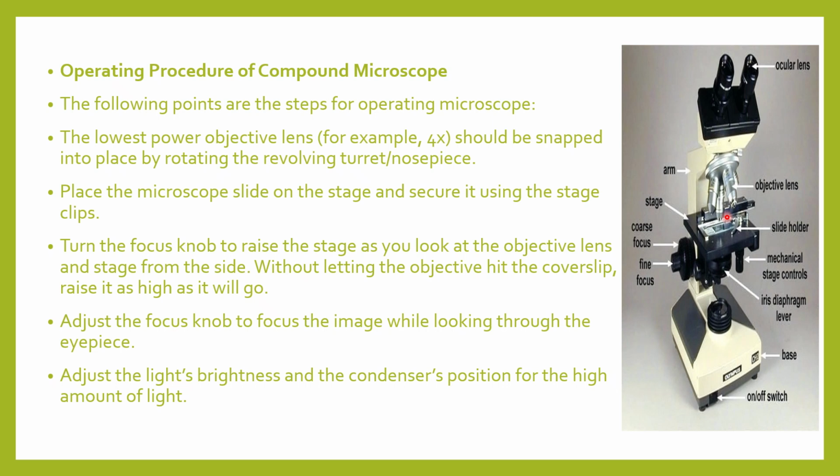Once you clip it, you can adjust the knobs over here. As I said, there are a lot of adjustments to be done. For example, you can adjust the stage here if you want to bring it above, or if you want to bring it below, you can adjust the stage over here.